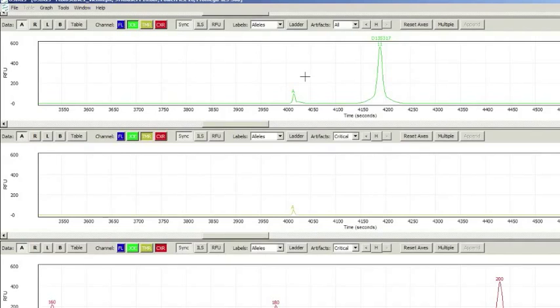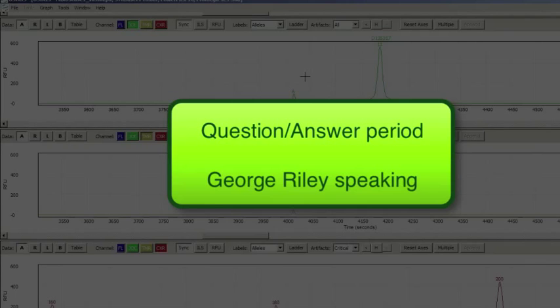So other questions. Is there an audit trail available? The audit trail is in the software. If you wanted a printable audit trail, that's something that we could certainly examine in terms of development. But currently you can't print it out separately. A number of laboratories are looking to go paperless using OSIRIS and the files themselves as the documentation for what they've done.